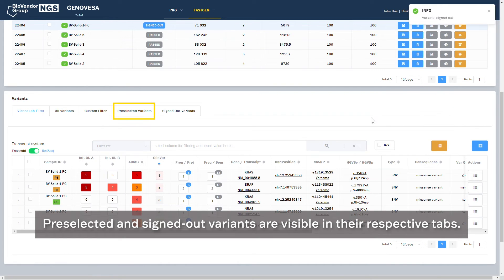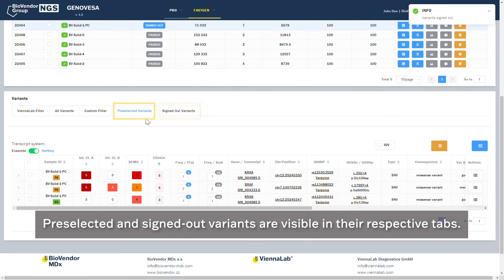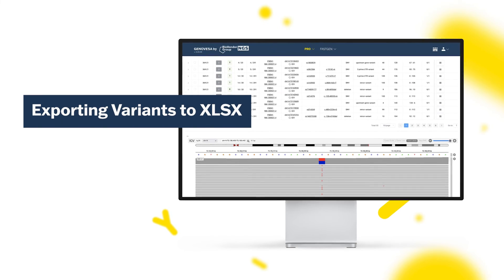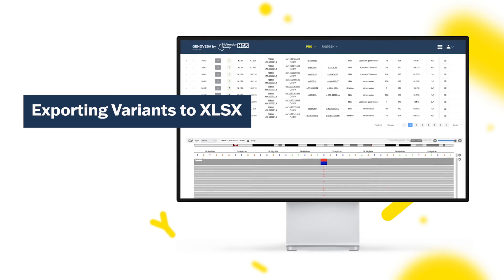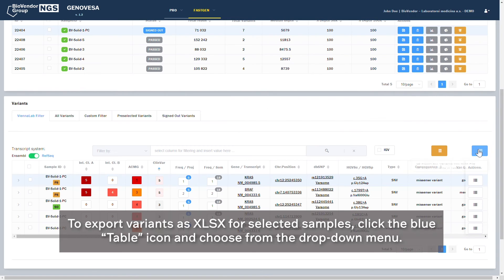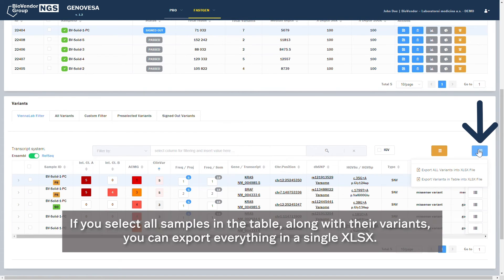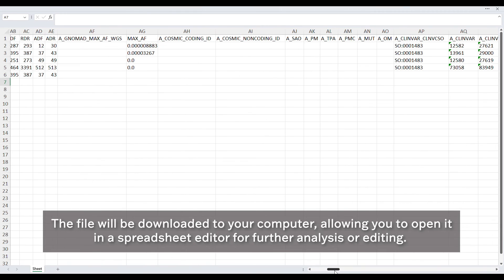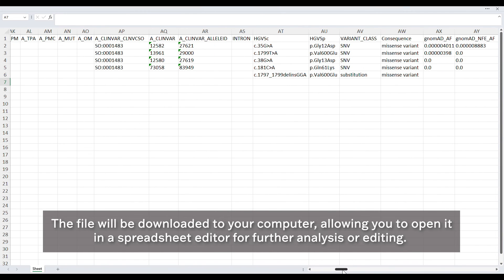Pre-selected and signed out variants are visible in their respective tabs. Exporting Variants to XLSX. To export variants as XLSX for selected samples, click the blue table icon and choose from the drop-down menu. If you select all samples in the table along with their variants, you can export everything in a single XLSX. The file will be downloaded to your computer, allowing you to open it in a spreadsheet editor for further analysis or editing.